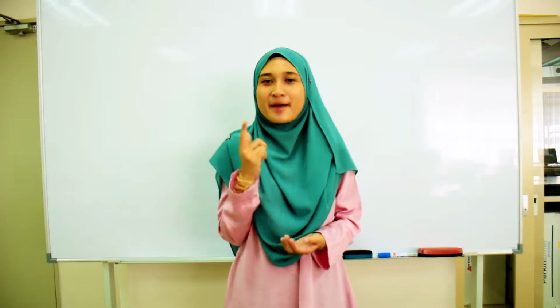Welcome to the CHM 260 introductory video where all the fun begins here. This course will expose you to the theory, application and basic instrumentation for chromatography, which are GC and HPLC. Next, molecular absorption spectroscopy for ultraviolet visible and infrared FTIR. Lastly, the type of atomic spectroscopy involved are flame atomic absorption spectroscopy AAS and flame atomic emission spectroscopy AES.